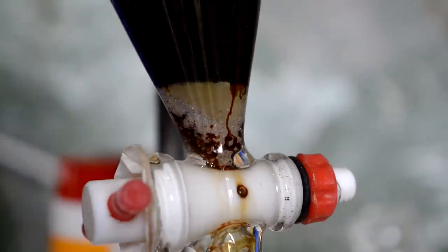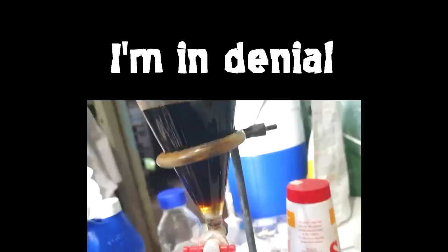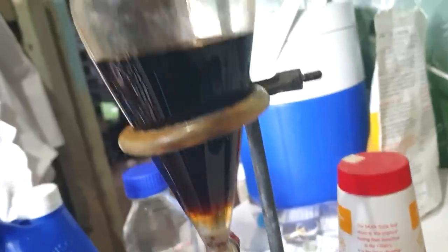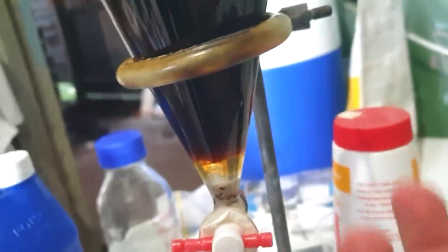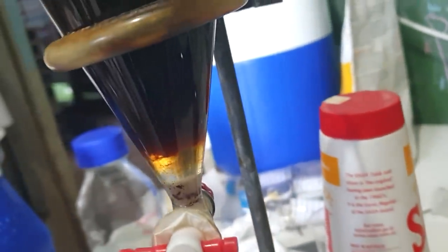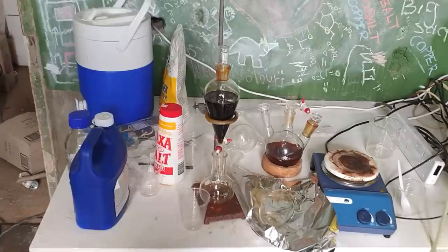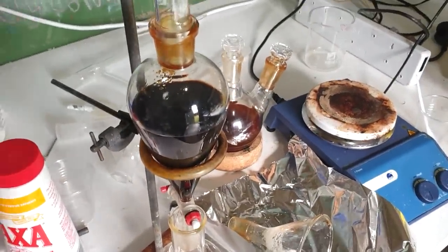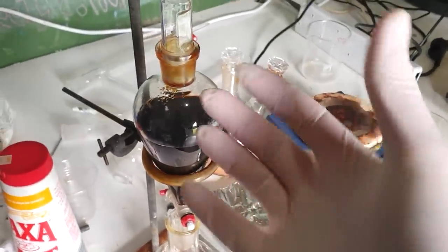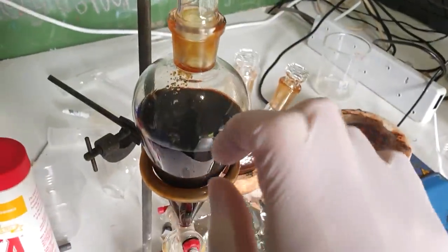All that settled out after like an hour of it, so this is not very good. It's not emulsified, it's just goddamn thick. I put a lot of salt in there to try and drive the water out, increase the density of those water droplets so they should sink faster, or something about polarity. So I did manage to form a perfect emulsion, but I think I've managed to break it. It was perfectly emulsified for 2 days, but I think I've broken it with a whole lot more salt and a little bit more toluene.